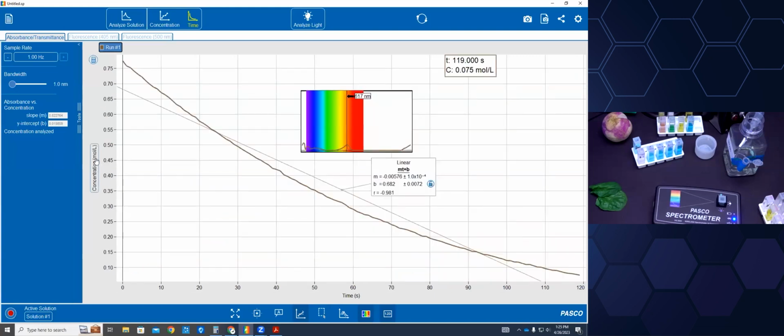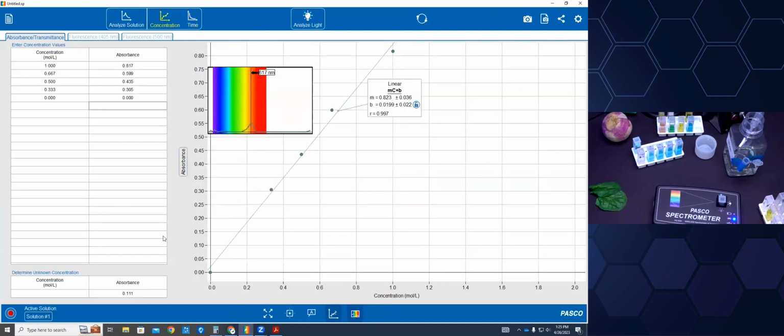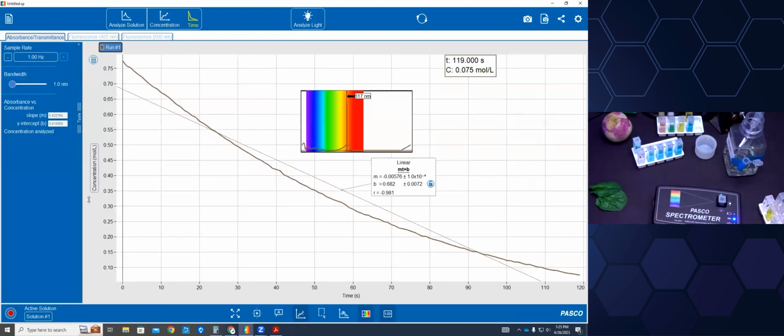So let's click the absorbance tab, and now, whoops, it goes to transmittance. One more time, and I go to concentration. How does it know concentration? Because we did this Beer's law back here. We told it how to figure out the concentration of a solution already. So now we can look straight up at concentration. We've got molarity here. We can get molarity over seconds for analysis here.